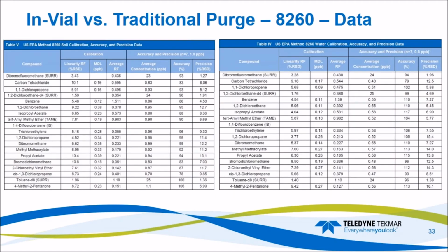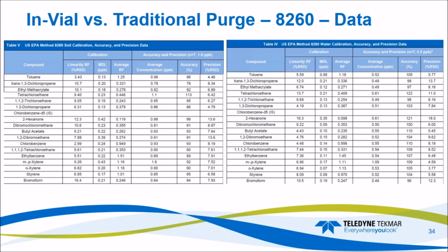Getting more towards mid-range compounds, still really great RSDs, the recoveries look great, and our MDLs are passing. And even into some heavier compounds, we've got our RSDs still looking really great and our MDLs passing.